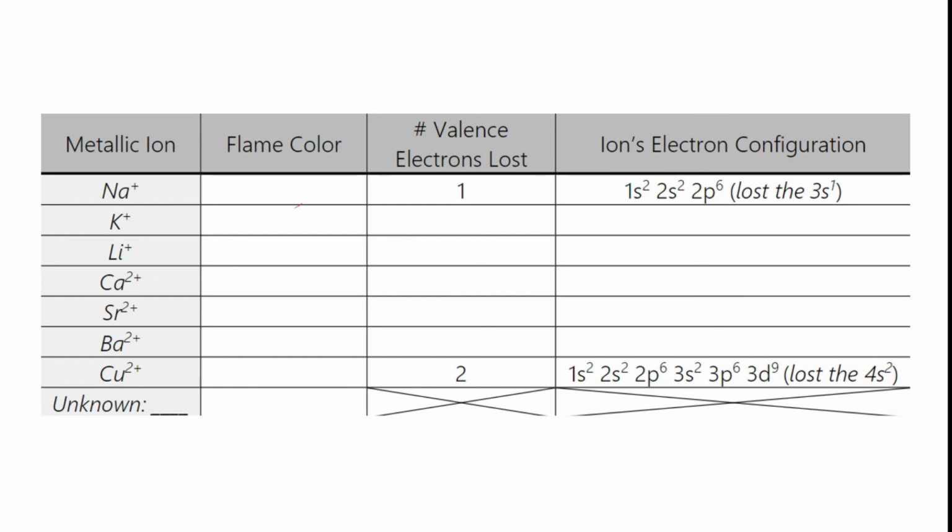Some of them will have similar colors, so they aren't all going to be individual colors. So, if two of them show up red, try and make them different from each other. Try and explain how it's not exactly the same color of red, and that's helpful.